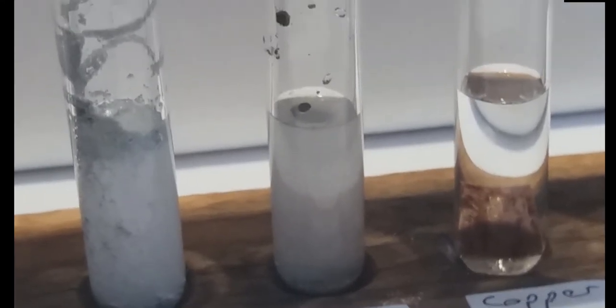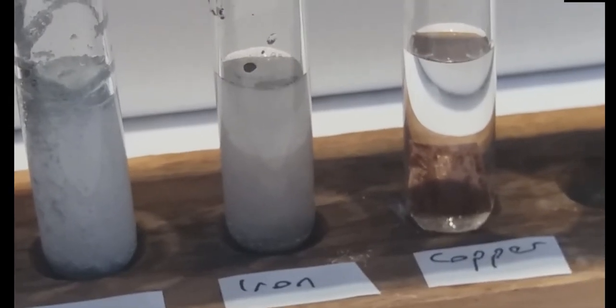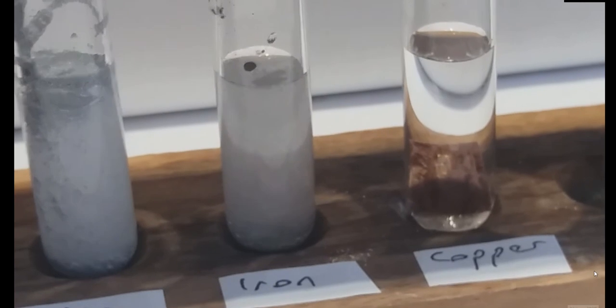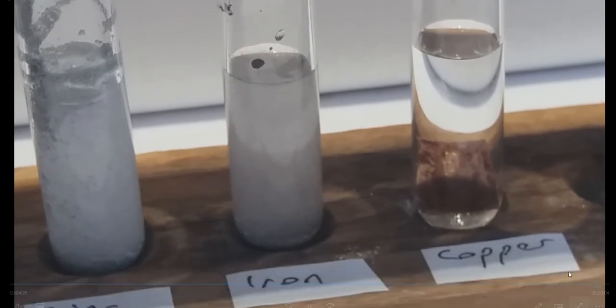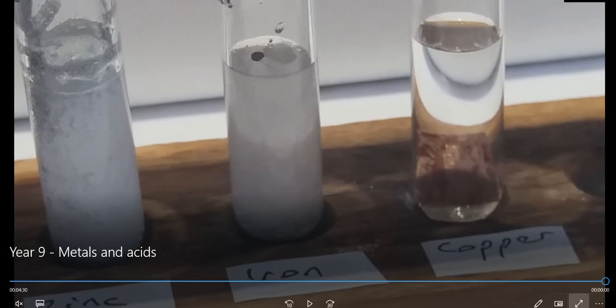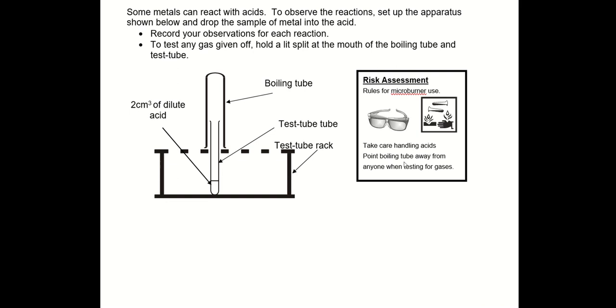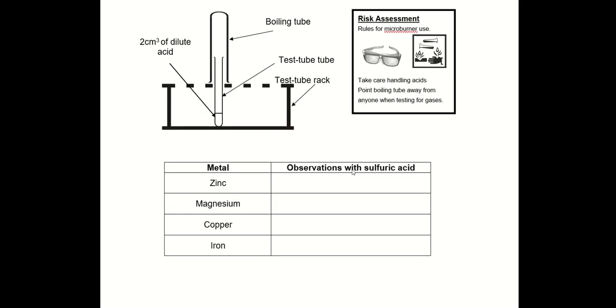So there's the reactions taking place. That's the reactions with acid, hydrogen sulfate. Sorry, I'll go over that again. Those that reacted with hydrogen sulfate must be more reactive than the hydrogen is, and they've been stealing away from it. Those that didn't are less reactive than the hydrogen sulfate.